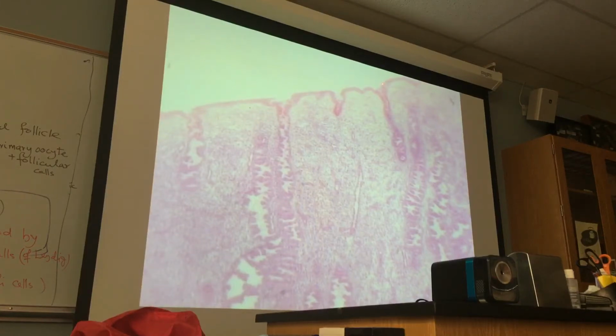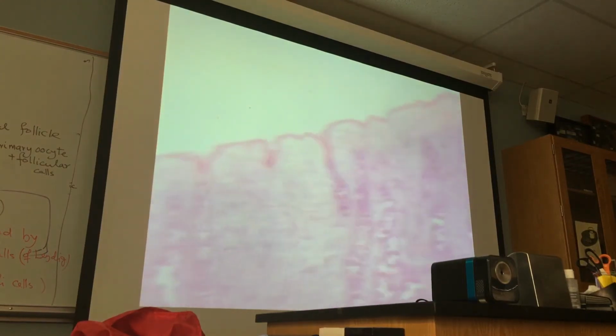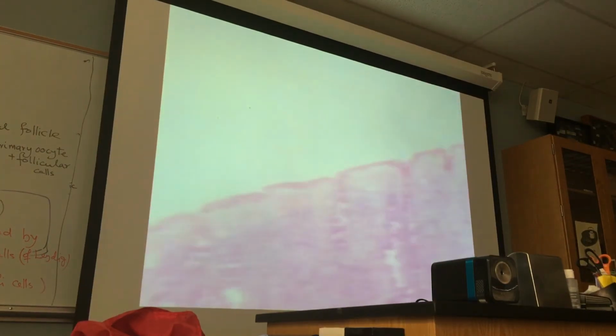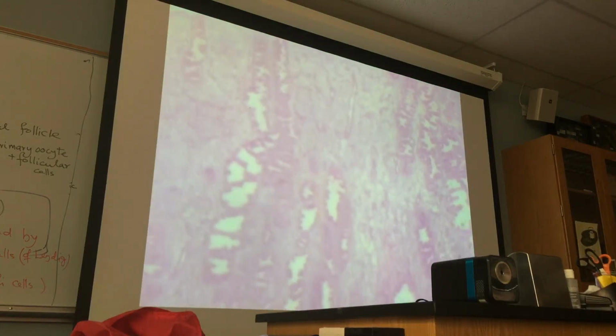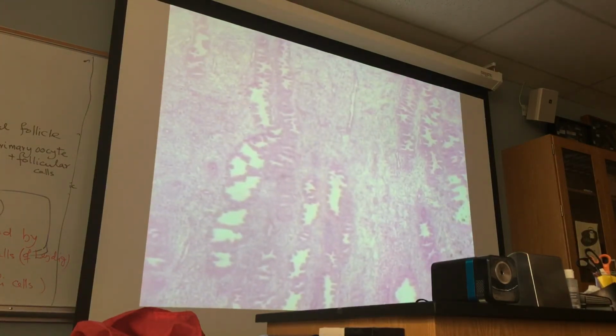Anywhere here, implantation could occur. Anywhere. If you survey this, anywhere on the surface. Do you get that? And if you look there, it will be simple columnar epithelium. This will be simple columnar epithelium. Now, this is very low magnification. And this is a pro-gravid uterus.